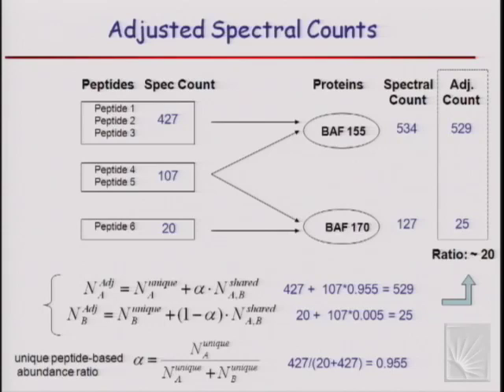Right, exactly. So, significance of change. We have a model. We worked this out for the differential expression setup in the context of spectral counts. In the context of protein complexes, the significance of change comes from those. You could come up with a model, like a mixture modeling-based approach, that would convert the ratio between protein abundance in complex A versus complex B into a probability that it's enriched in complex A versus complex B. But yeah, that's a work in progress, but it's a good question.